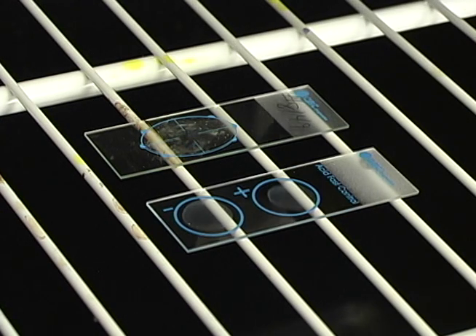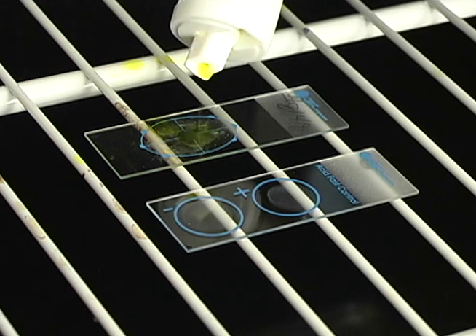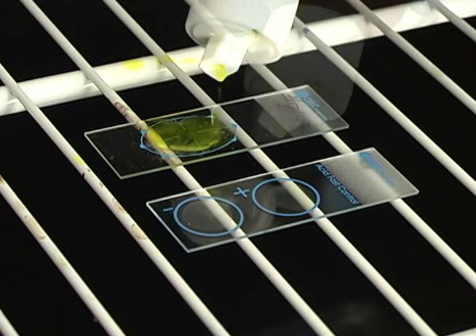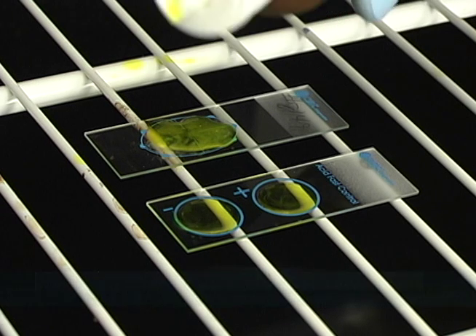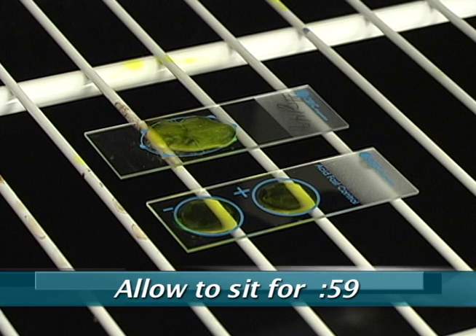To apply the auramine O stain, dispense 8 to 10 drops or enough stain to completely cover the smeared area. Allow the slide to sit for 1 minute at room temperature.